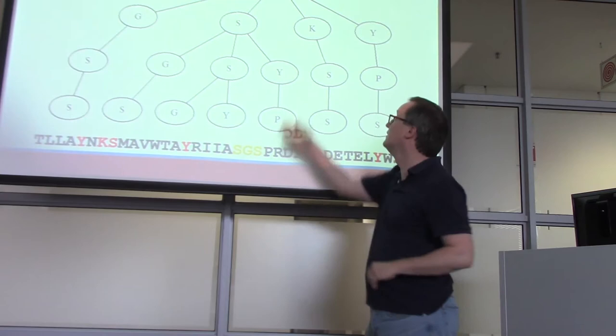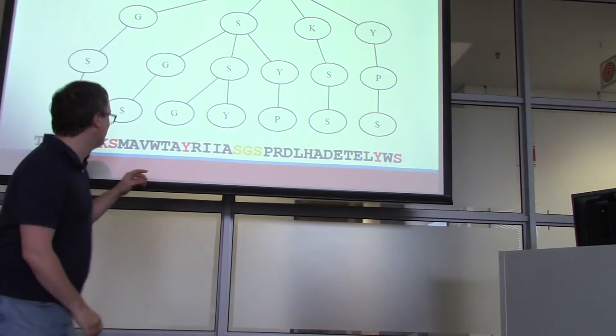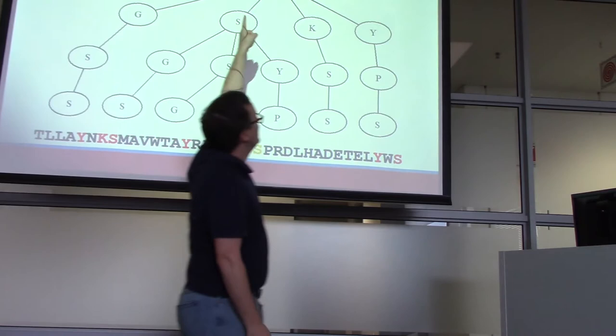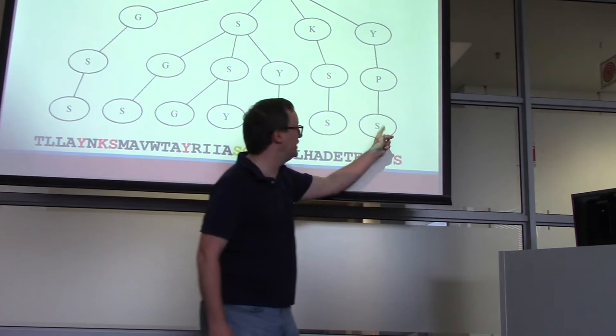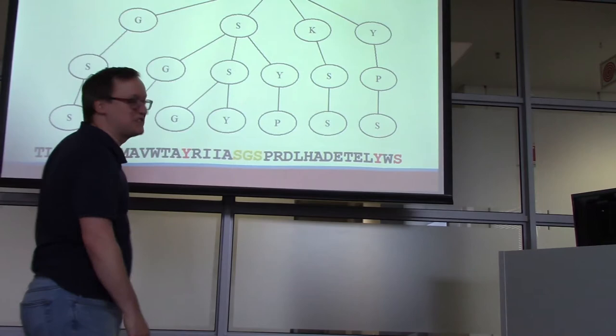So normally I love having the students sort of act as the pointers in the data structure. We're not going to do that today, I'm sorry. But you can see that when you hit a Y, you get a big hit over here. But the software doesn't care about getting a hit in this row. It only cares when you get down to here. So we have a hit on the Y, and so when you check the next letter, N, it sees, can I move from Y to an N? Nope, not represented here. So that one falls right off.